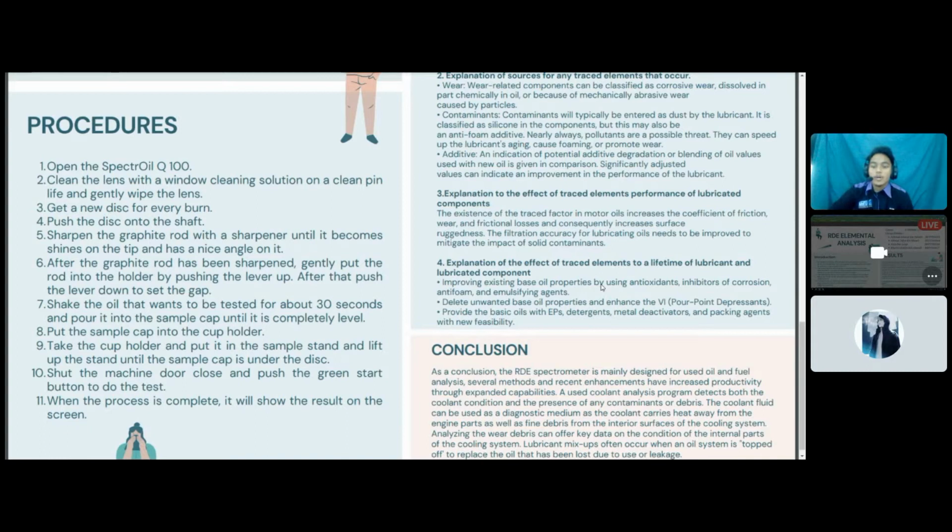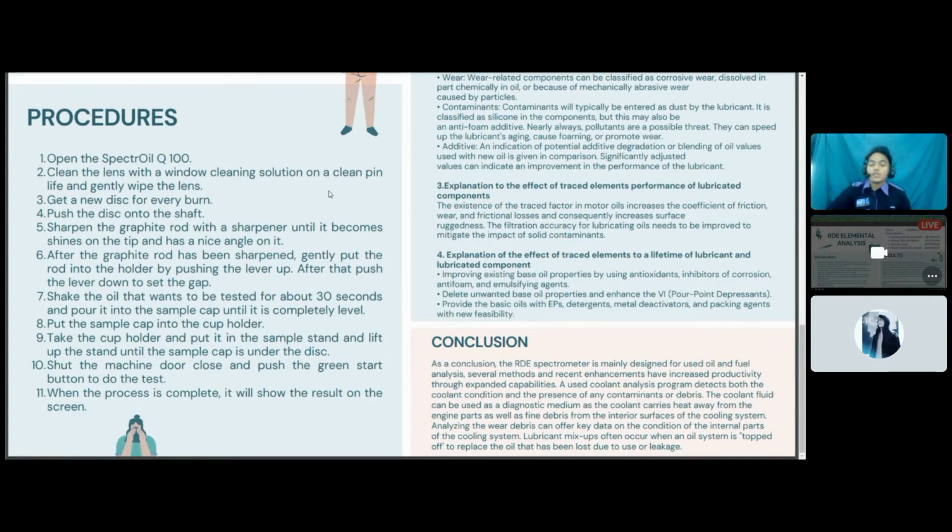For the procedure for RDE elemental analysis, first, we need to open the Spectro Q100 machine to proceed with the next step. The second step is to clean the lens with window cleaning solution.